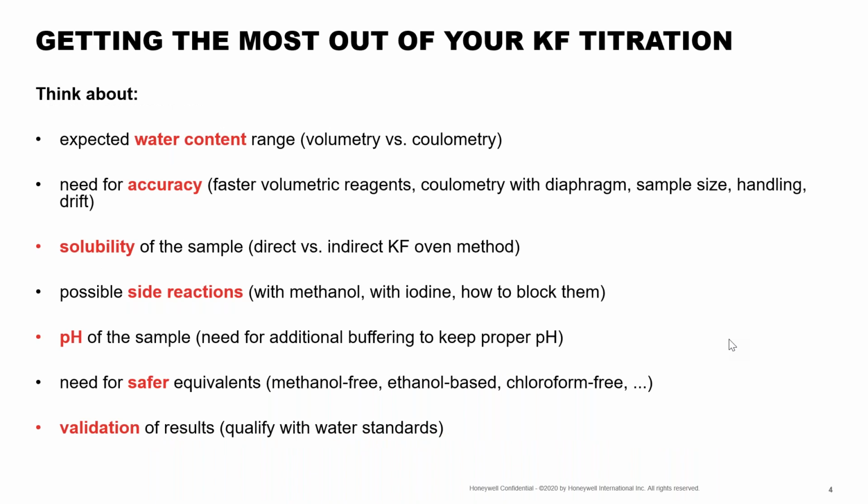Now let's jump right in. Now that we've learned the history as well as the basic chemistry behind the Karl Fischer titration techniques, let's dive a little bit deeper into how we can be the most efficient in our technique and get the most accurate results possible. So Karl Fischer titration is a little bit unique. Unlike many other analytical techniques, it's really dictated by our actual sample being analyzed.